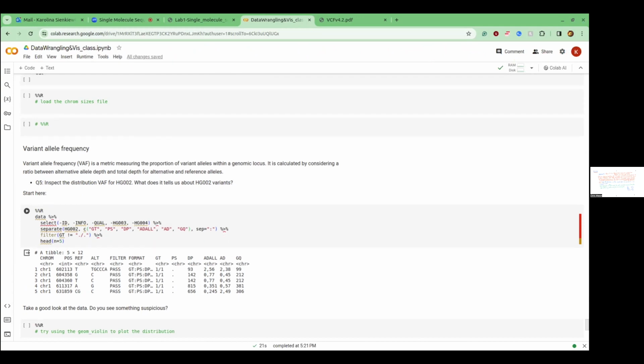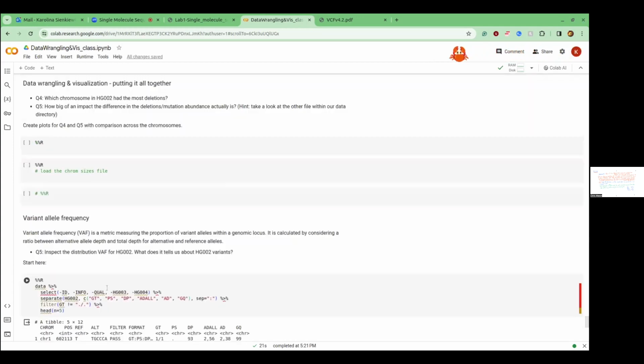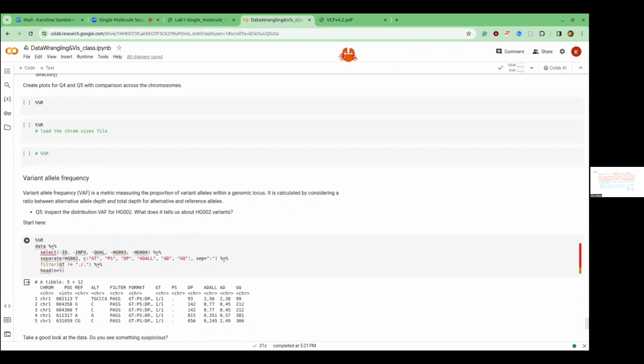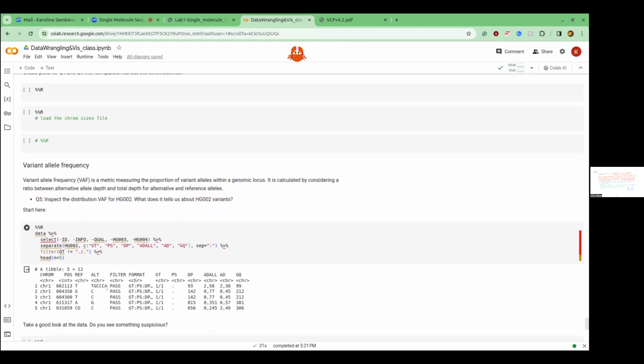The filter field thresholds are very low, right? So most things will pass. By default, I usually just drop things that are not passing. If there are so many of them, then I would take a look. Second thing that you can take a look at.